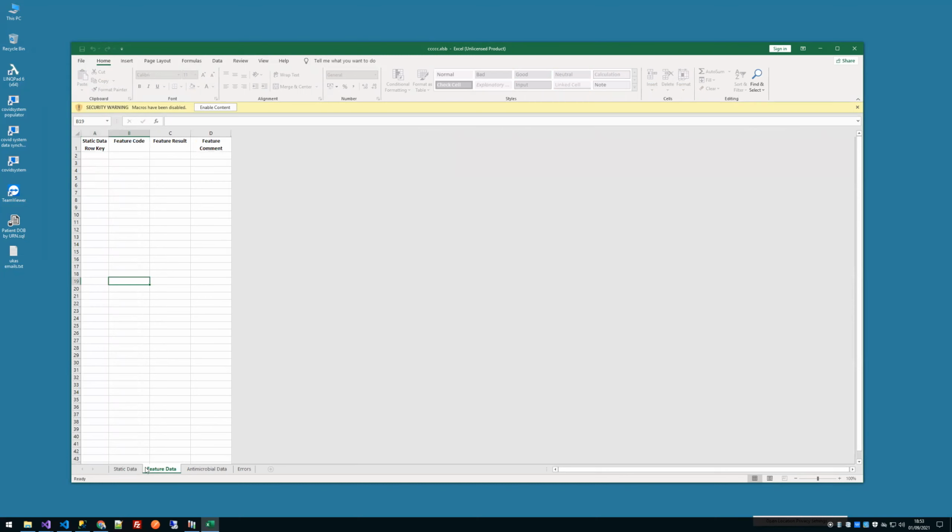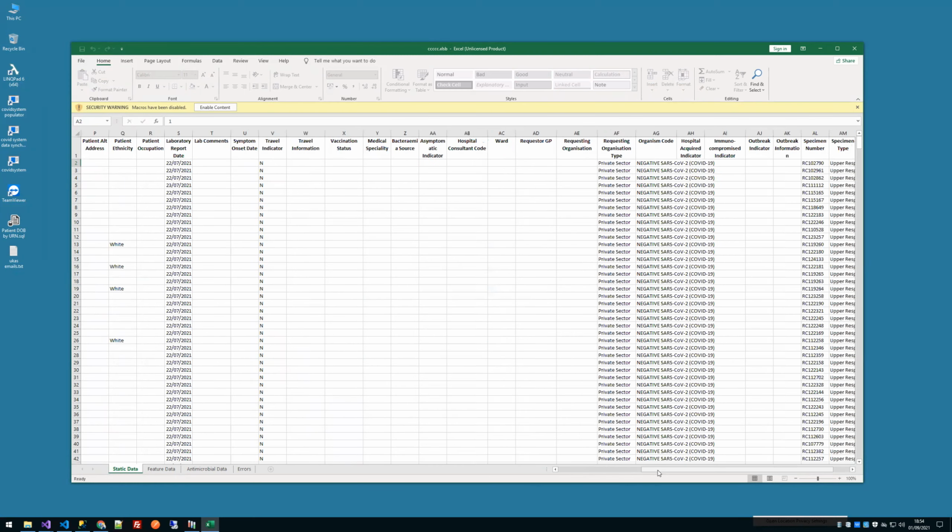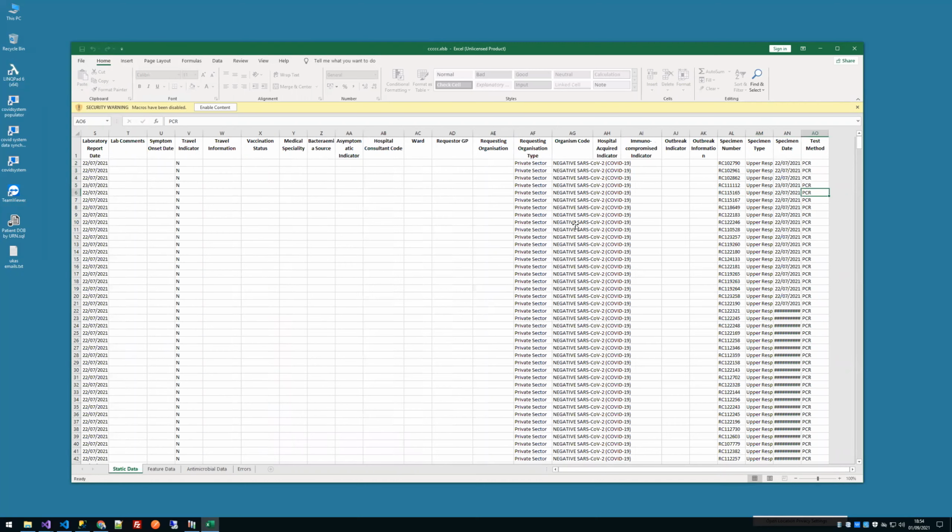There's stuff around the day 2, day 8 that needs to be put in there. I'm still waiting on that, some confirmation I need from Bilal. But you've got your RC number. You've got obviously all the different kinds of information in there. The test was negative, and this is ultimately what you would send.